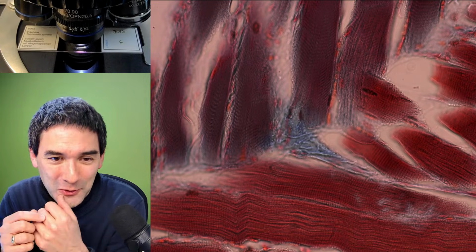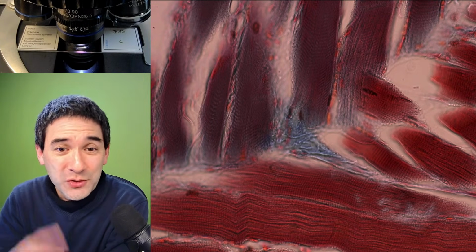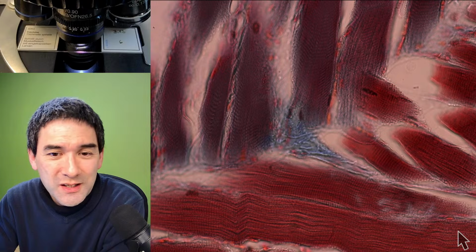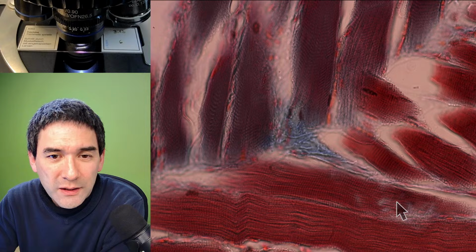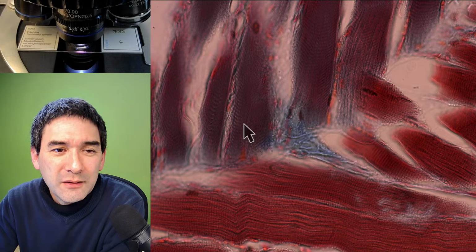And because somebody wanted to know a little bit of biology, one of the things that the early microscopists realized is they had seen those striations. Of course, they didn't know what it is. I can just show them to you, those striations. If you look very carefully, I have to now get the arrow moving here. You see that there are those little stripes going across here, and also over here.